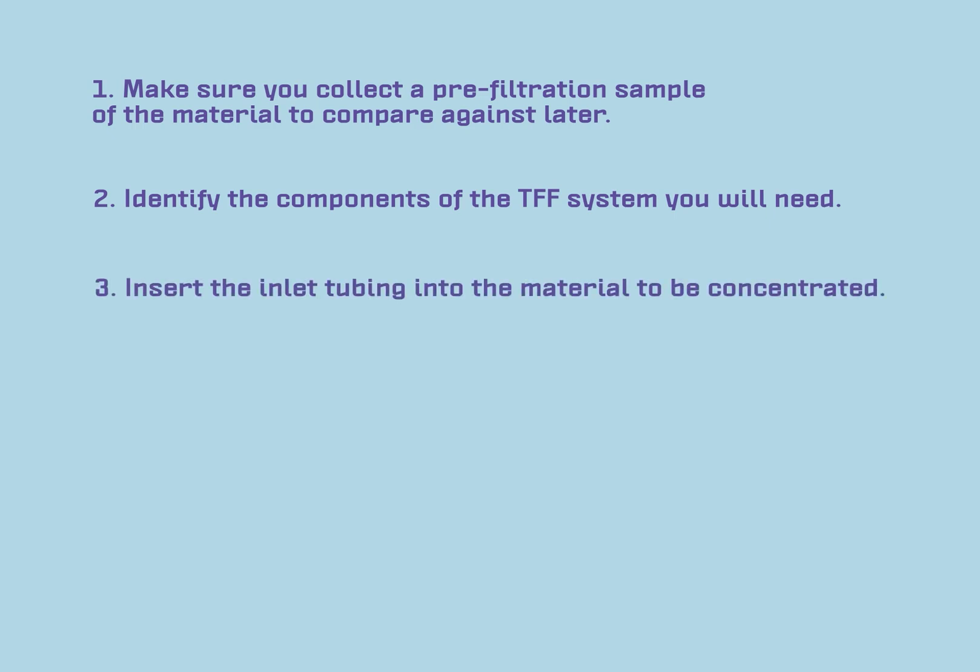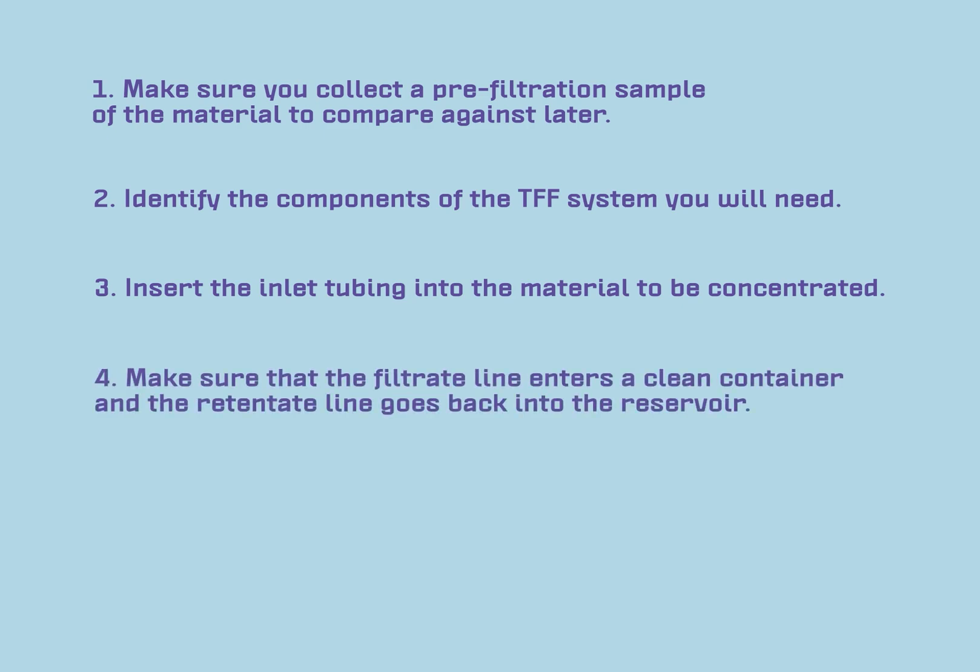Insert the inlet tubing into the material to be concentrated. Make sure that the filtrate line enters a clean container and the retentate line goes back into the reservoir.